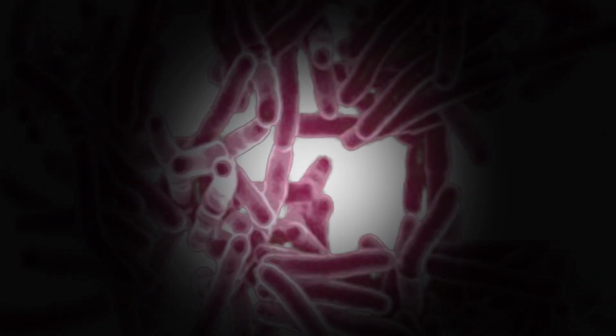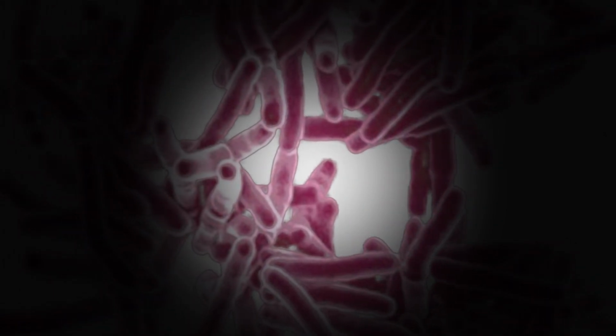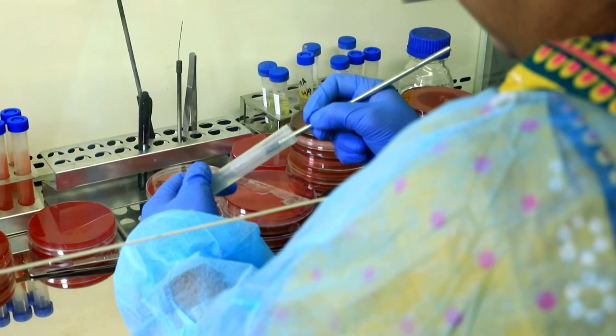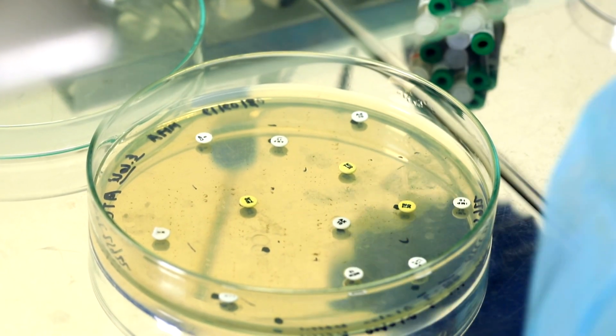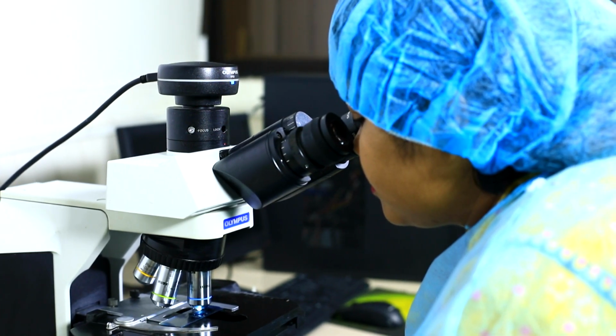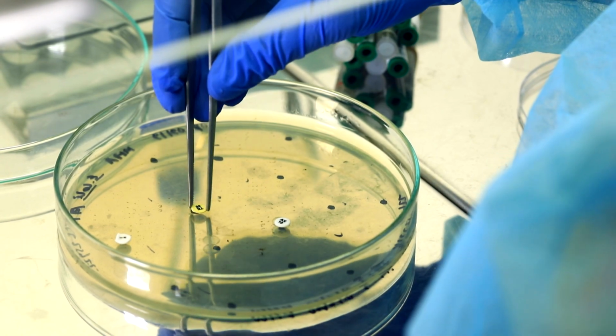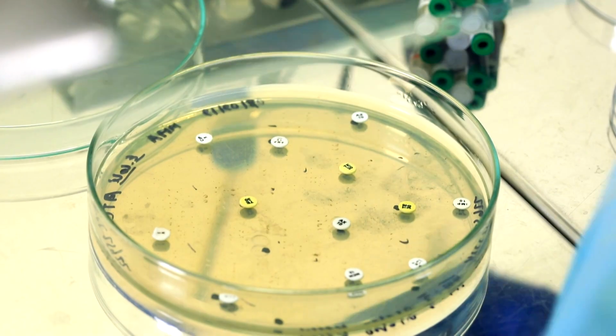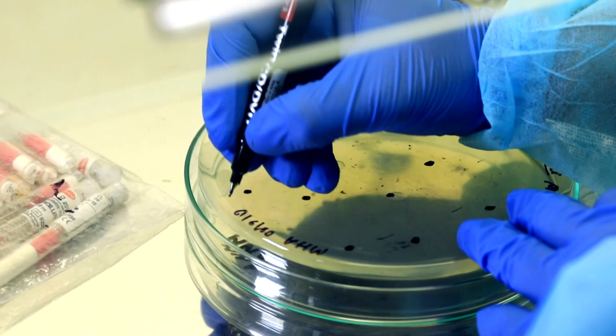Bacteriology Lab works on morphological study of pathogenic bacteria. This lab often conducts biochemical and culture sensitivity tests of medically important bacteria. This lab started antimicrobial resistant tests on 15 commonly used antibiotics in poultry.